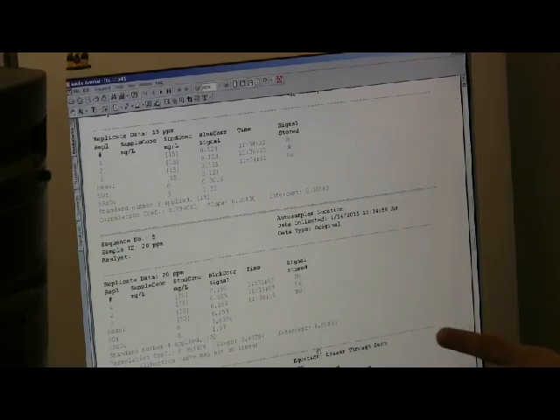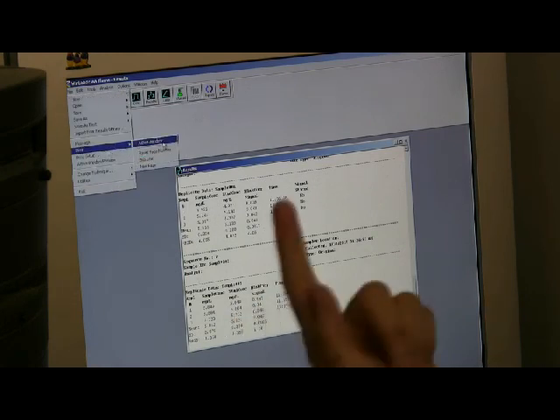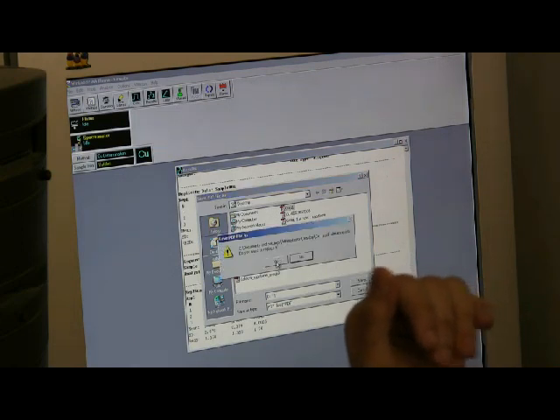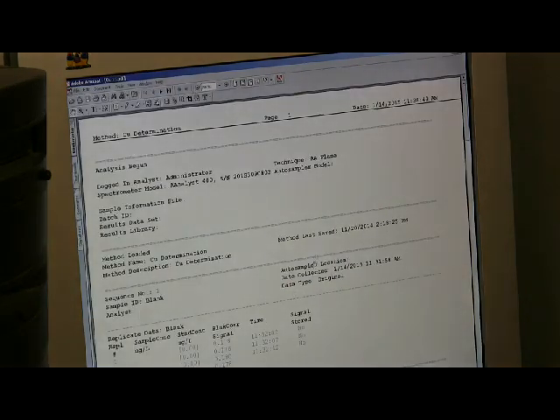Okay, this happens a lot. This first page is blank. If you're lucky, you might just get a very good result. So what you do is you just print it again. Print active window, okay. Replace it, yes. There you have it.